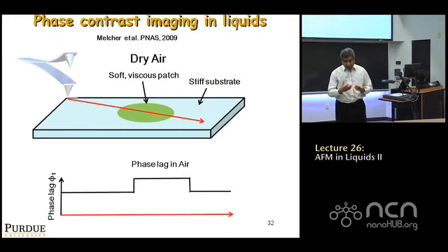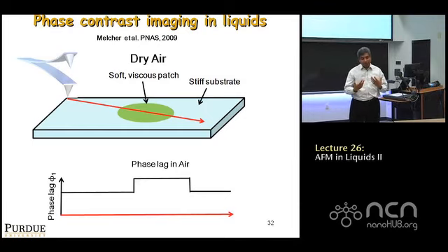The question always is, what's the source of the energy dissipation? In air, people would always think that the source of the energy dissipation is non-conservative or dissipative forces between the tip and the sample. That is viscosity, for example, right? Because you come close, move away, you've lost some energy because of some viscoelasticity of the sample, or it could be because of bond making and breaking. And so the typical interpretation of phase lag would be connected to energy dissipation between the tip and the sample.